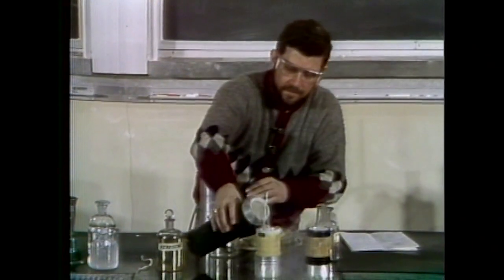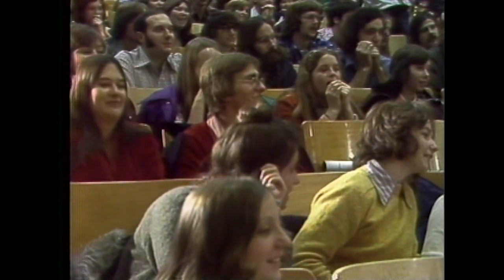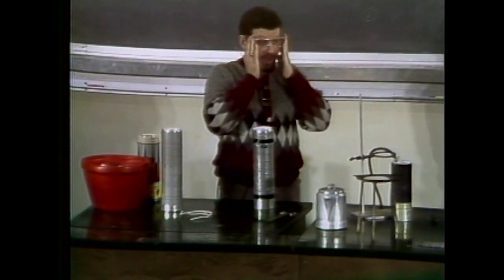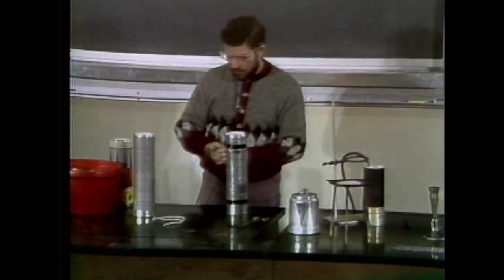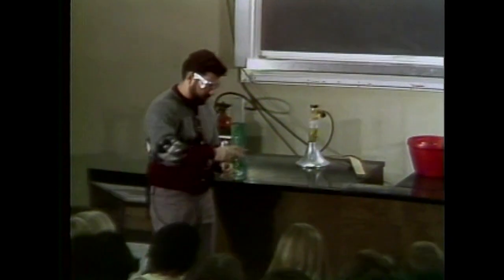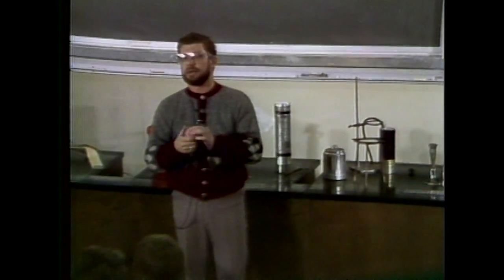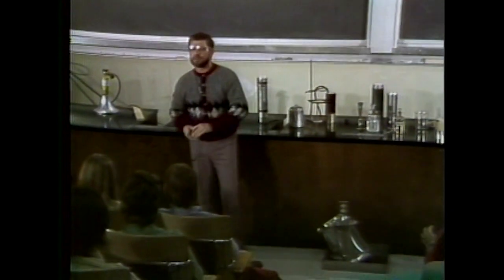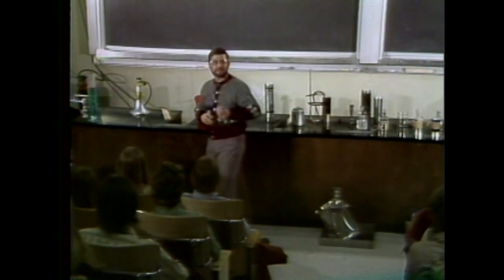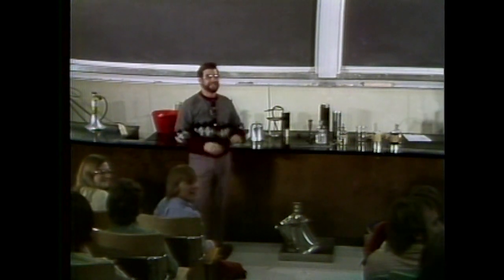Let's see, how are we doing here? Add a little more nitrogen. Make it go. Well, there are so many properties that compounds have, and we're familiar with them. For example, one compound that we're going to be talking about in the second semester is rubber. And here I have a simple rubber ball, and I wanted to make sure that it is a rubber ball, so I'll just throw it out to you and check it out and see. Is it all right? Got it, right? You want to check it on this side here? There you go. Couldn't catch it.